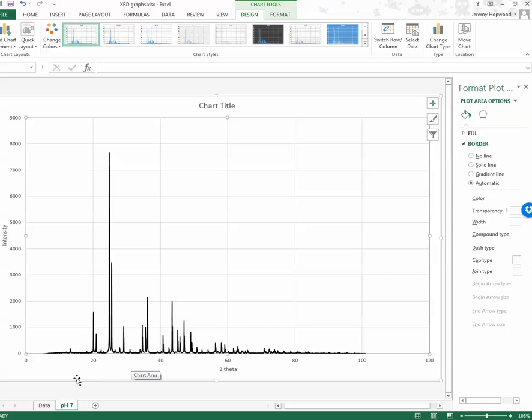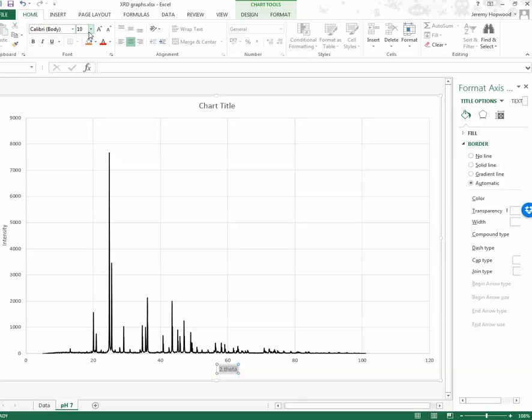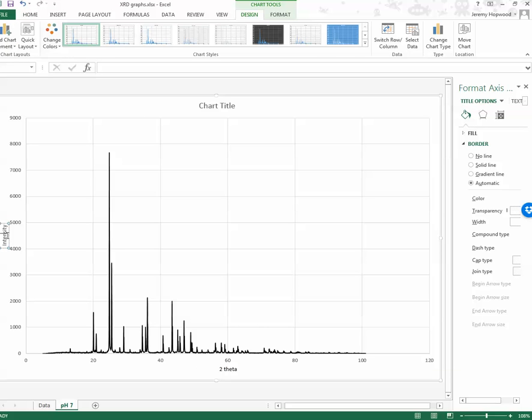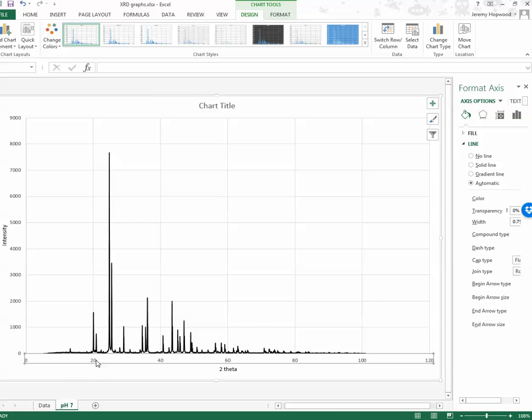And you'll notice at the moment everything on my computer's defaulted to grey. So you need to change these. You need to change everything to being black and white. So I've selected this one, gone to home, and then the colour needs to be black. So that's black. And then this one here, same again. Select it, and then home, colour needs to be black and white. And it's the same for the axes.